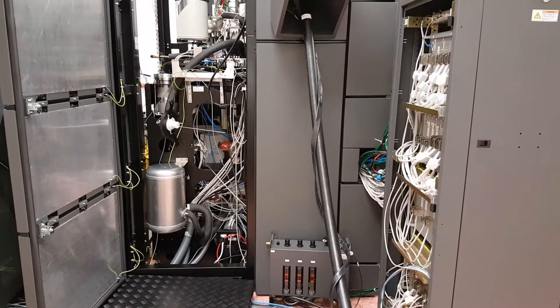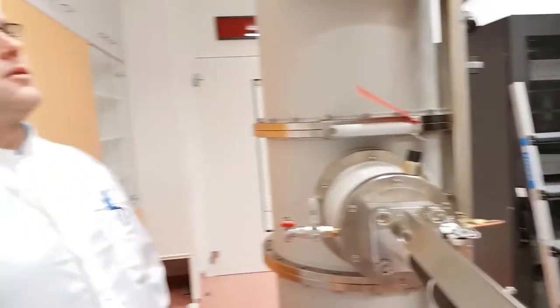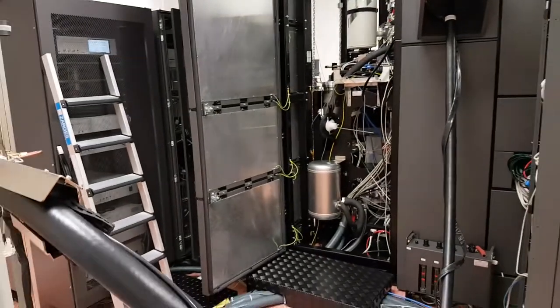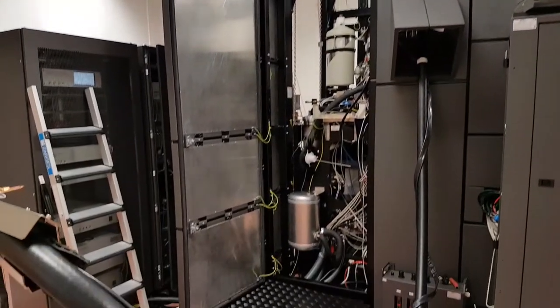So with these instruments, we can see objects as small as 0.08 nanometers. So 80 picometers is the specifications. Cool. It's not the sort of thing you would have in your average garage lab, is it really? Not really.